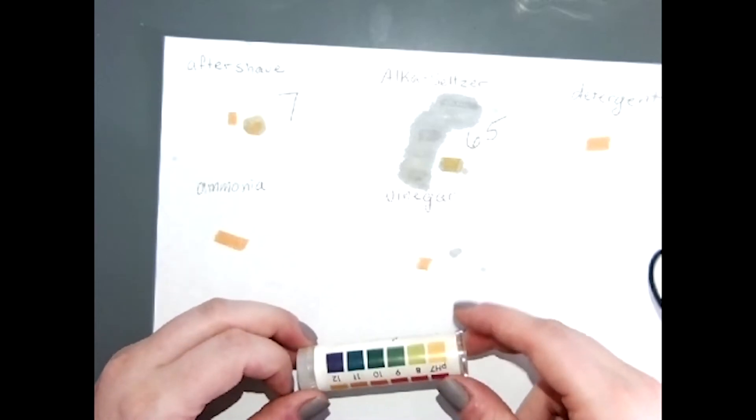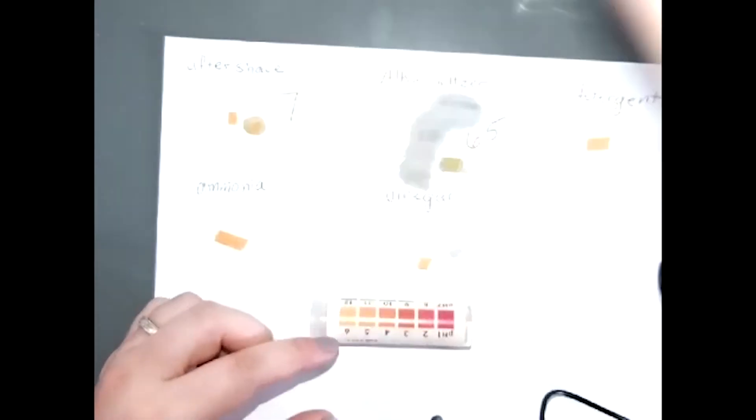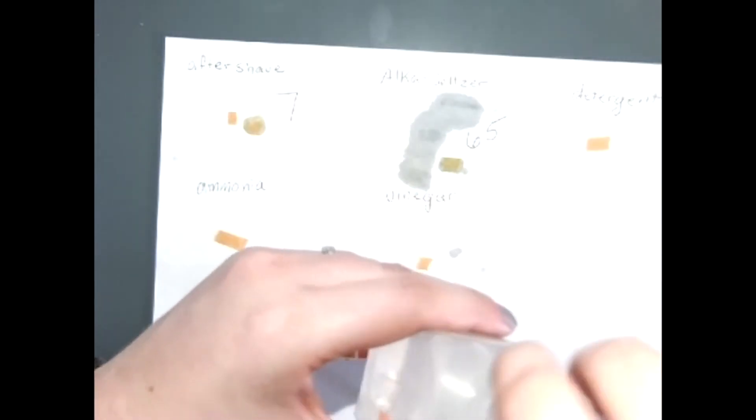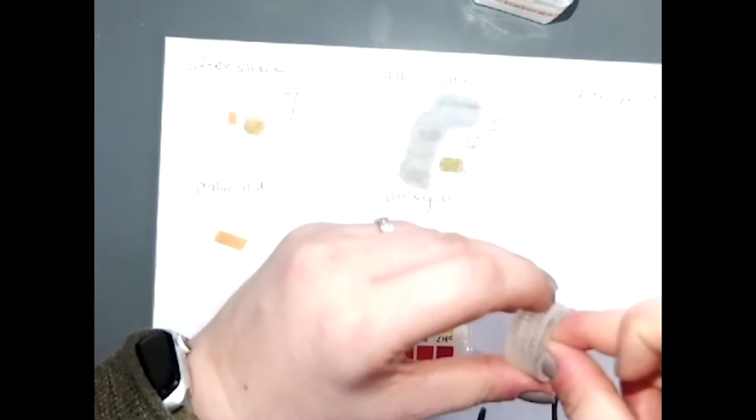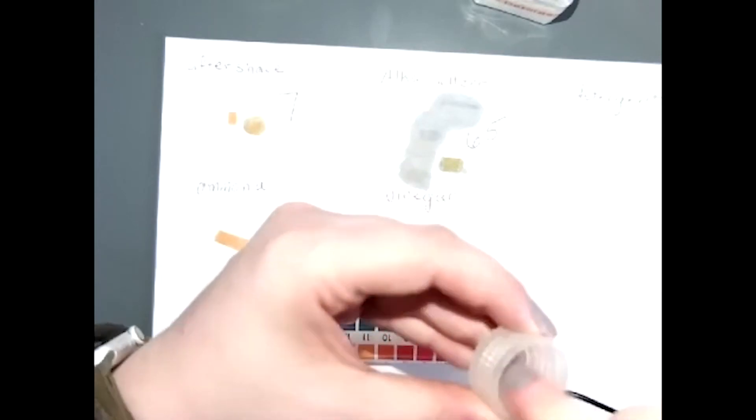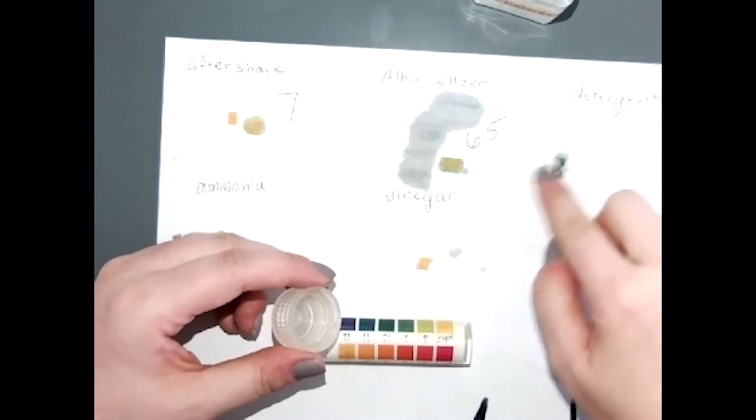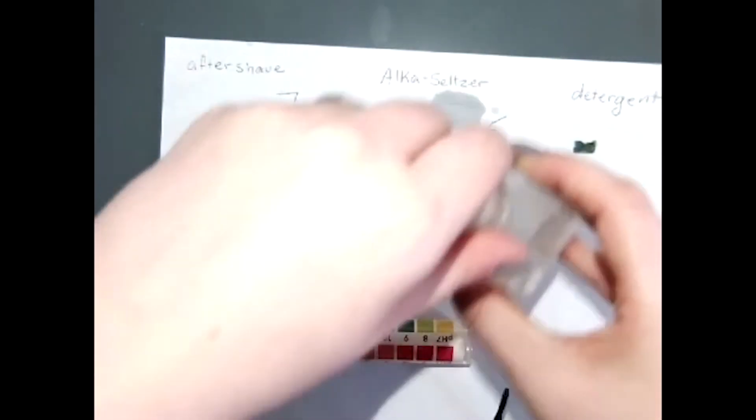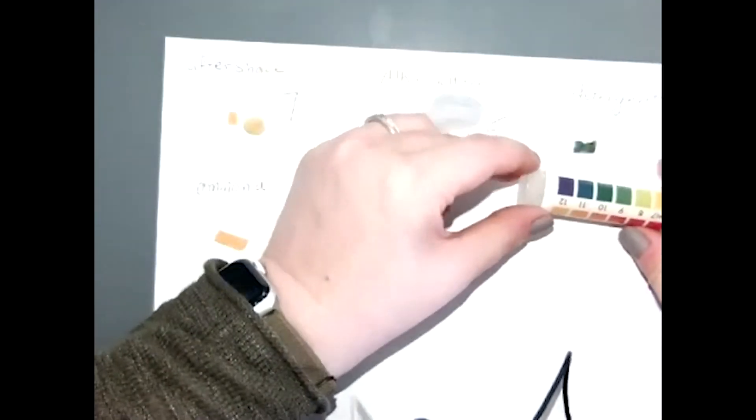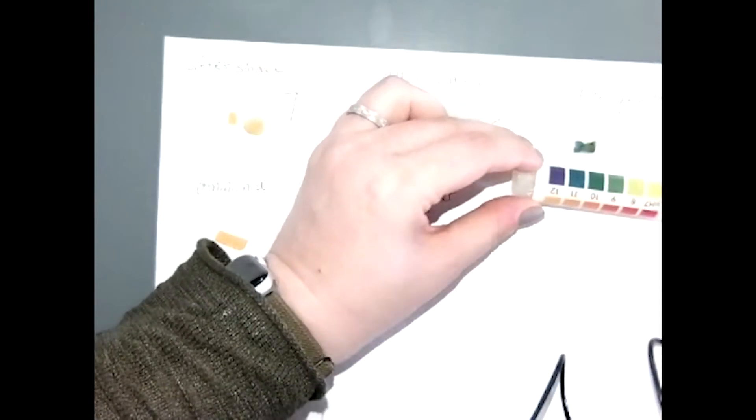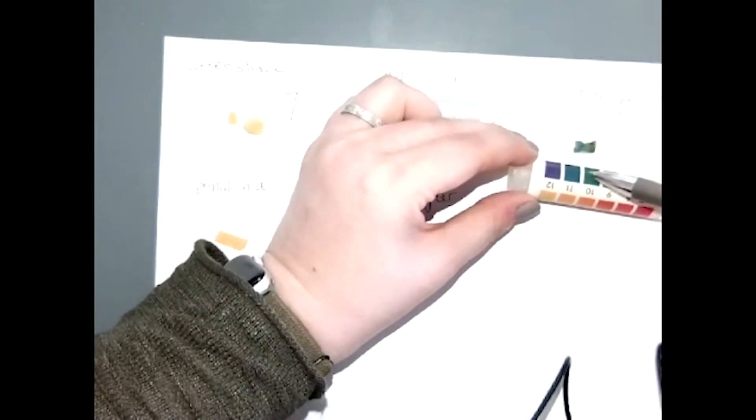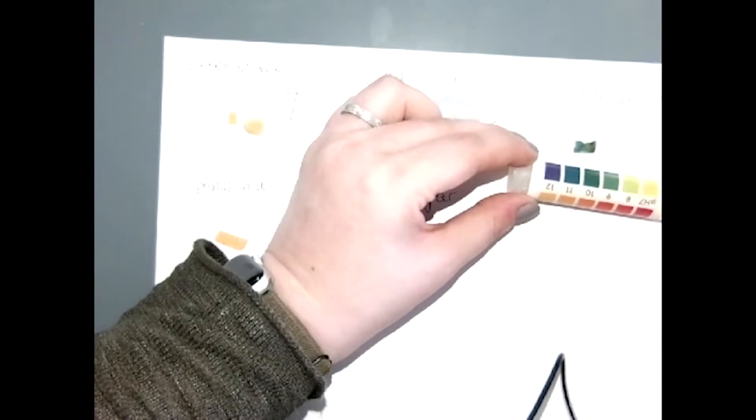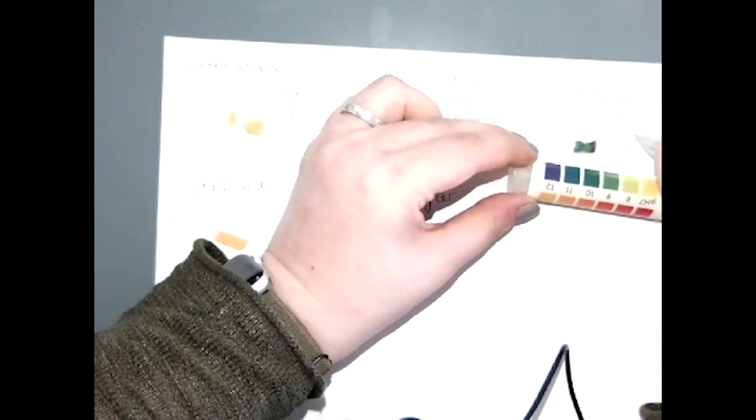Then we have detergent. That is fairly dark. I would say that that is somewhere between the 10 and the 11 in color, so I'll call that 10 and a half.